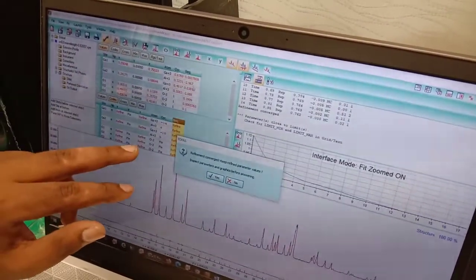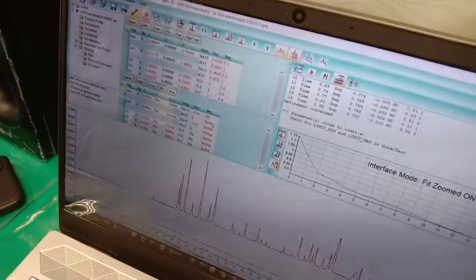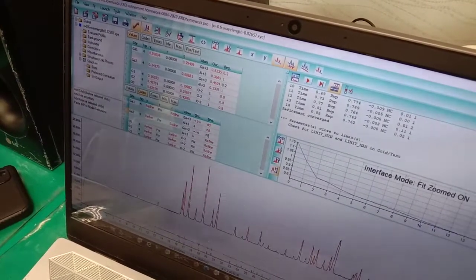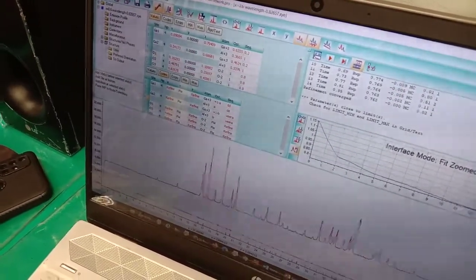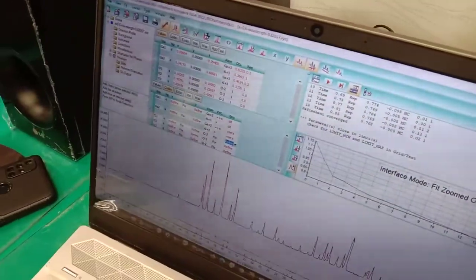Now you just see it's turned into minus 207. Yeah, that's not right. That is not right. So what we actually do is we refine it based on the sites. I just say DD. What is DT? Any word you can write. Even you can write your own name. Okay, but you see, I write my name on both sides, right? Which means it's some kind of constraint. The value should be the same. Okay. So here I just write.